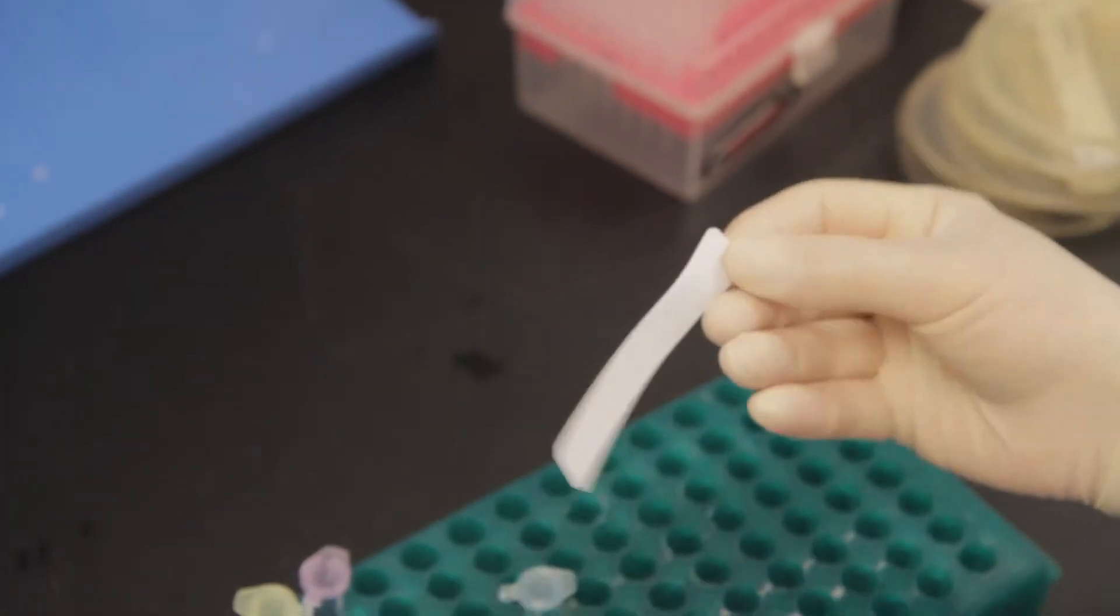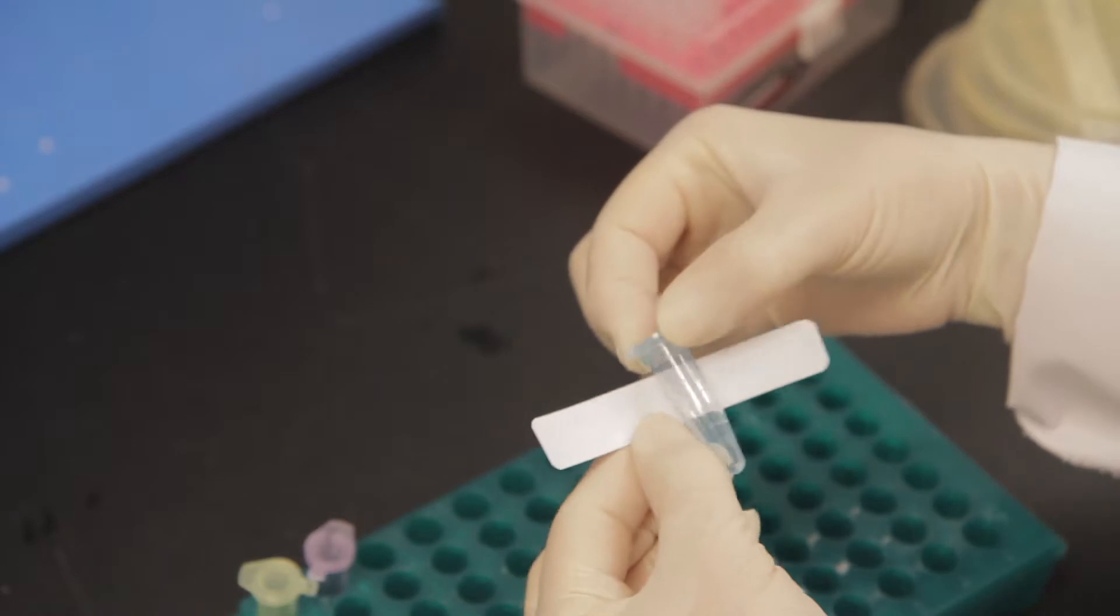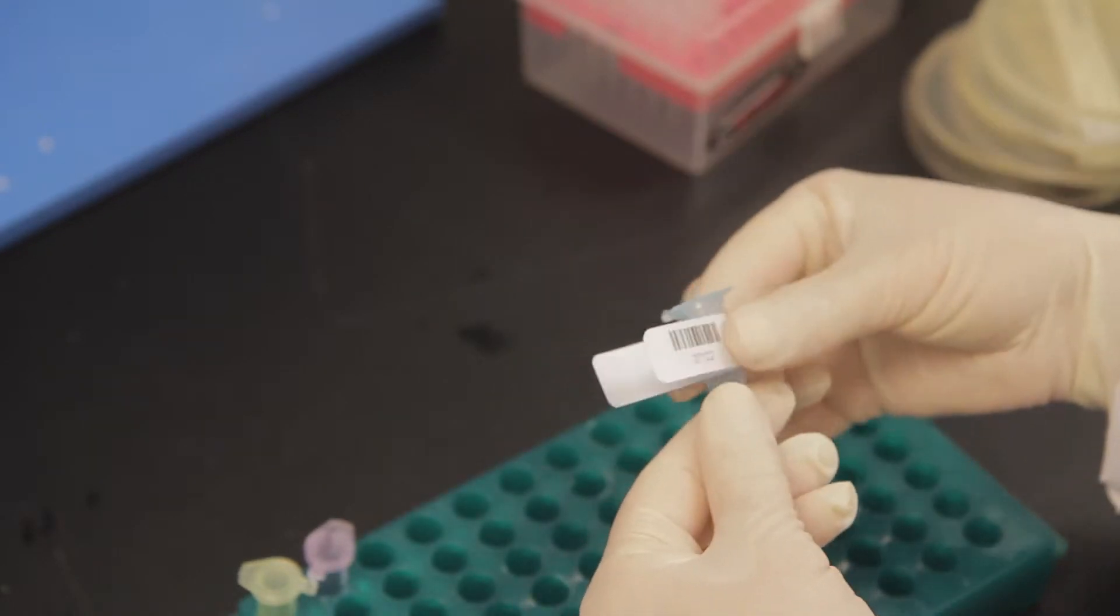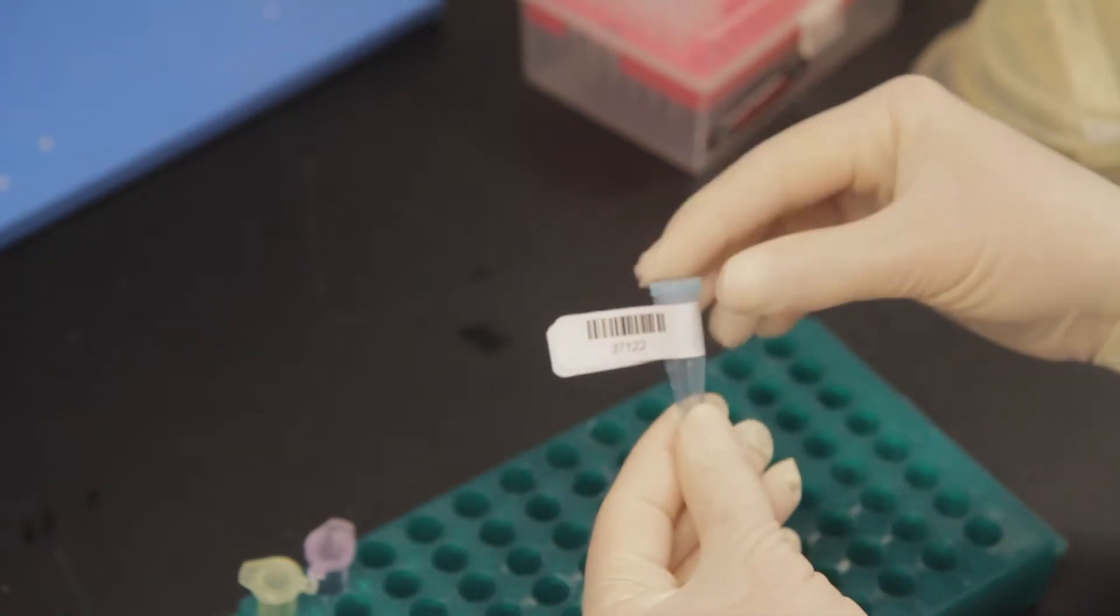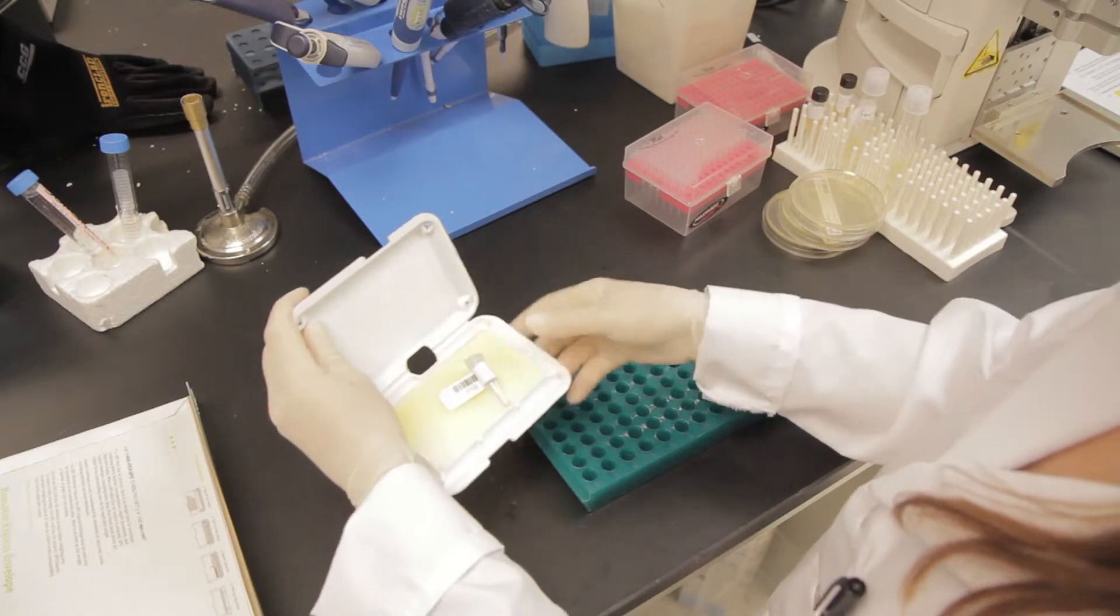If barcodes were enclosed in your package, adhere the barcoded labels to the tubes so that the barcodes can easily be scanned. Place the tubes in the plastic shipper and place the shipper in the shipping envelope.